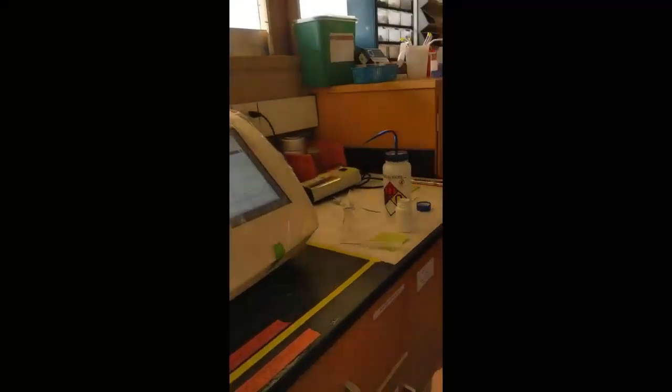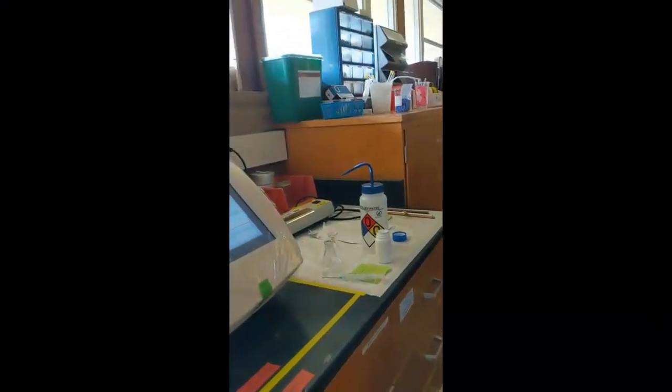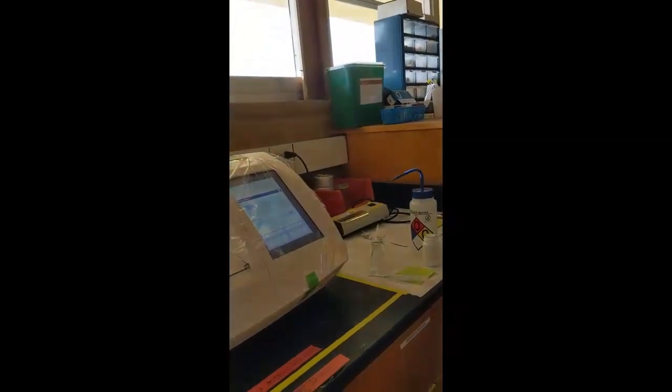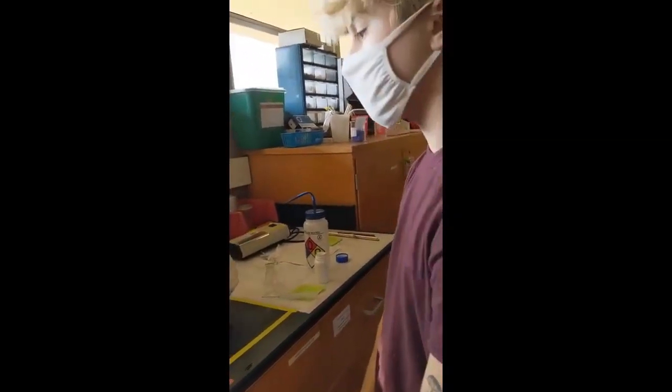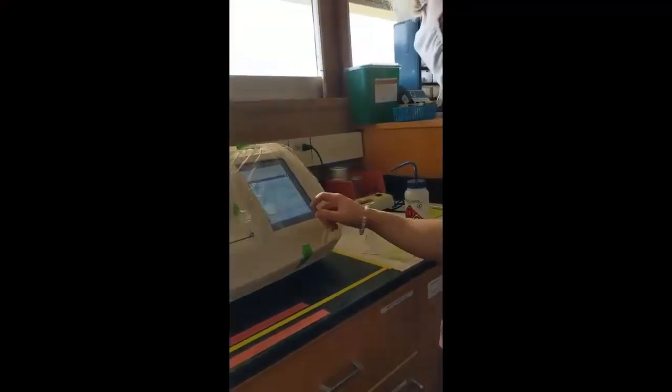Neat means there's no solvent, okay? Now I have to tell it what the concentration is. The cell that you have is the 50 millimeter one. It's short. There's a longer one, but that's a shorter one. Now we're going to put the concentration. So click on this thing right here.